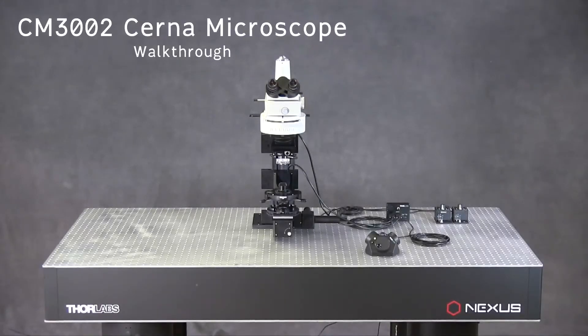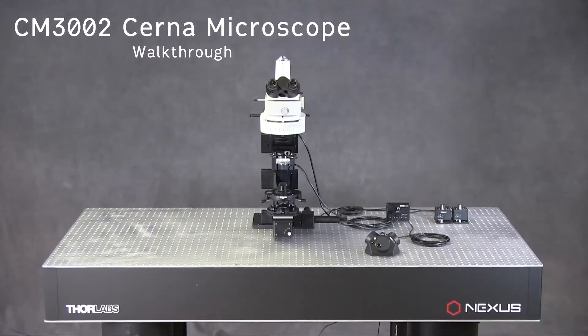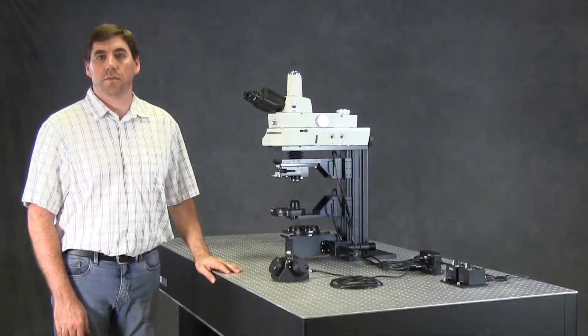Hi, my name is Paolo. I'd like to introduce you to the CM-3002 CERNA microscope, which is designed for DIC imaging and wide-field microscopy in the visible and near-infrared.